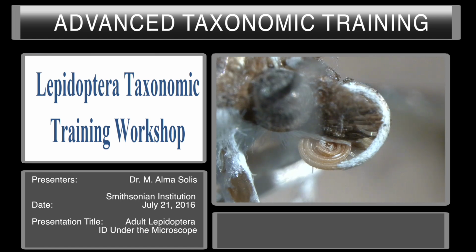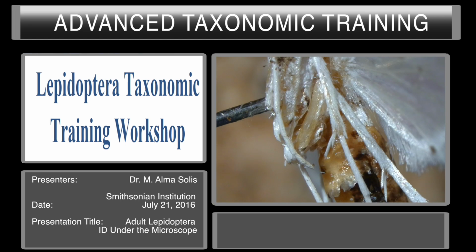If they have scales on the base of the proboscis, they can be either a Pyraloidea moth or a Gelechioidea moth. The next step is to look at the abdomen to see if they have tympanal organs or not. Gelechioids do not have tympanal organs on the venter of the first abdominal segment. Pyraloidea does. So you will look for the tympanal organ between the metathorax and the first abdominal segment.